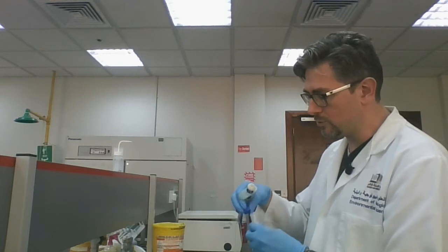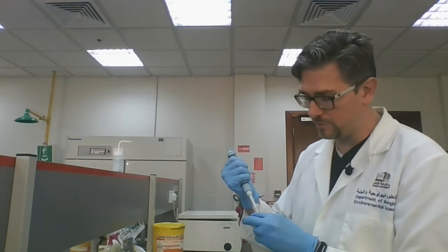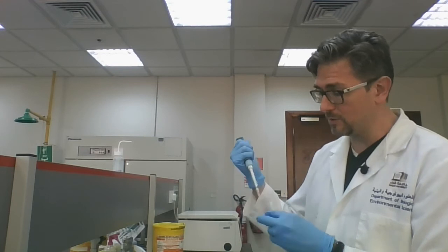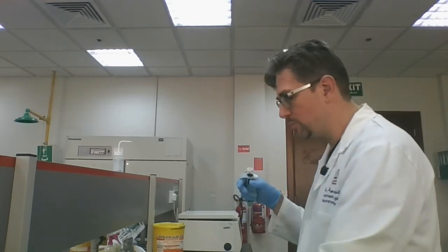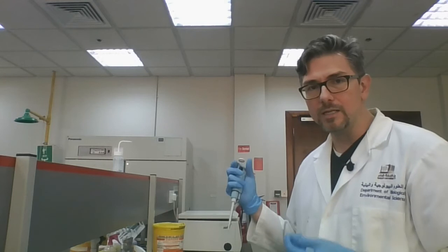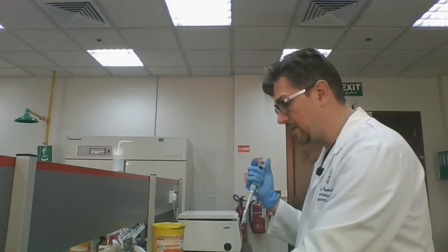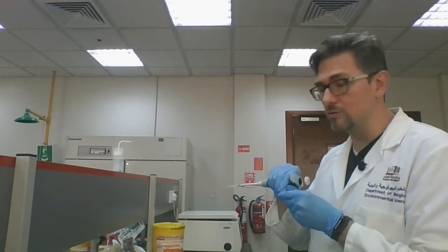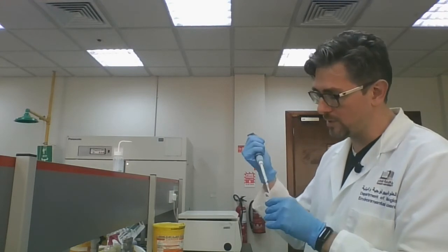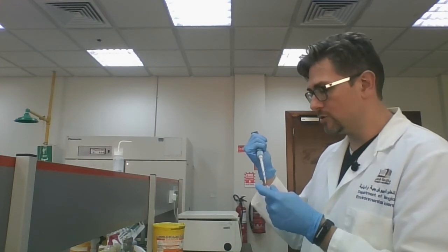Okay, this is going to neutralize the pH of our solution, and it's going to allow for the renaturation of that genomic DNA, as well as our plasmids. Now, again, because plasmids are highly supercoiled and they're very small, they will renature very quickly and they will remain in solution, whereas the genomic DNA is going to struggle to get back into solution and to renature properly because it's so much larger. And so it's going to precipitate out.